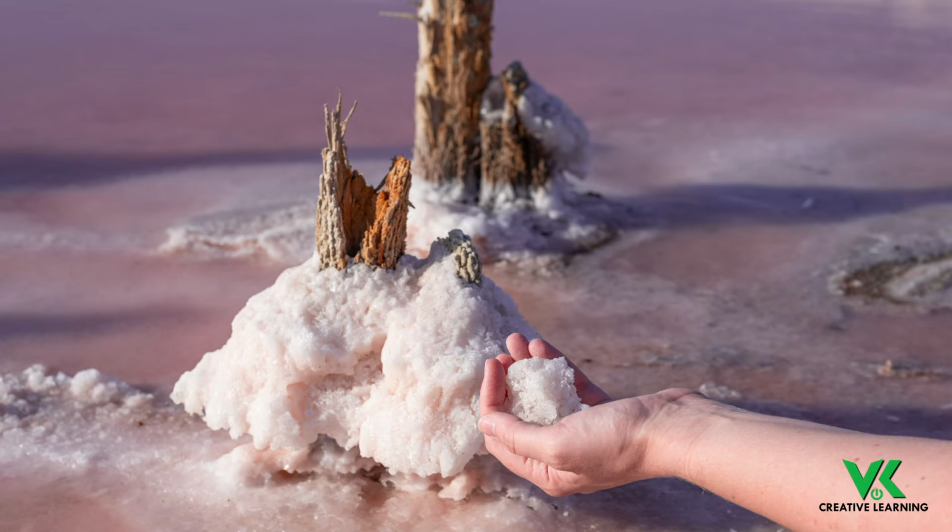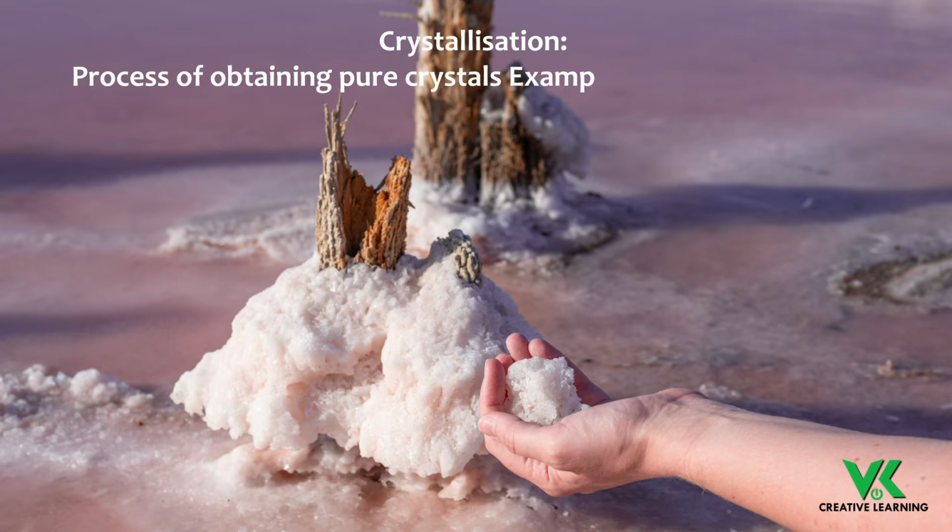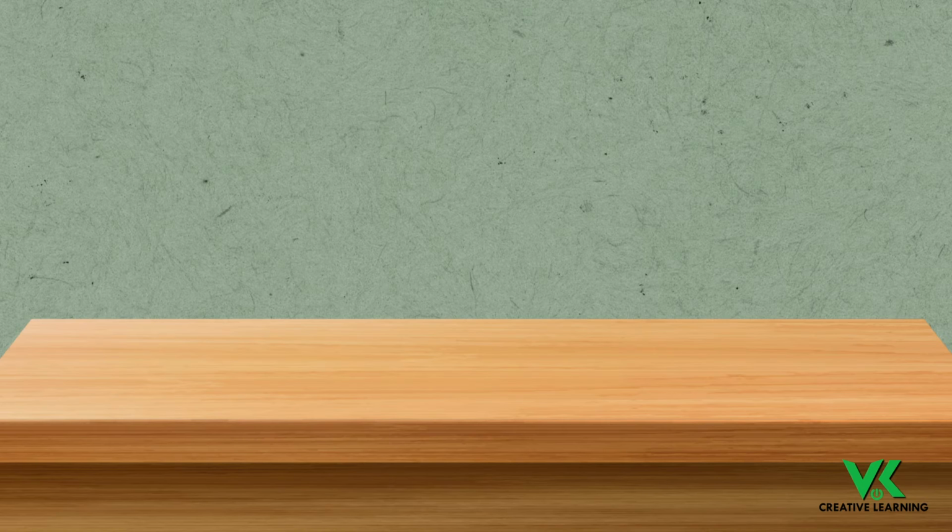Have you ever seen salt crystals being prepared near the coast? The crystals obtained in this manner are not pure crystals. Pure crystals can be obtained by the process known as crystallization. Crystallization is an example of physical change. Let's understand the process of crystallization with an experiment.